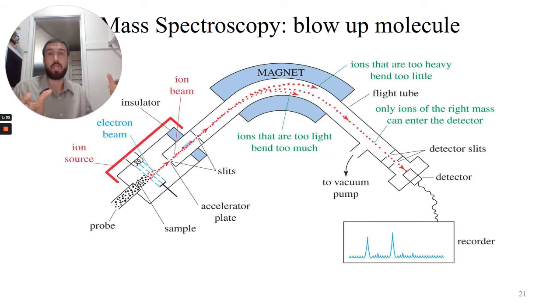The pieces that break apart are going to be more stable. We wouldn't expect a piece to break off that would be unstable because it just wouldn't form. It would react immediately with the pieces around it. So it explodes apart into a variety of these pieces. We now need to separate those pieces away from each other so that we can interpret what those pieces are.